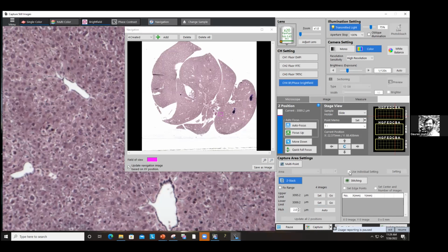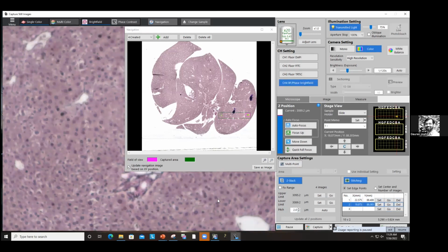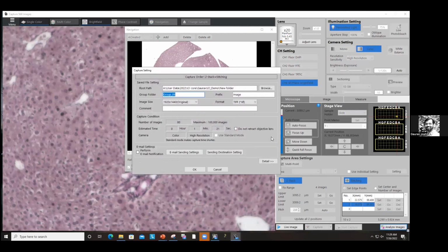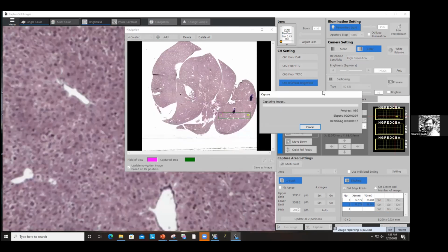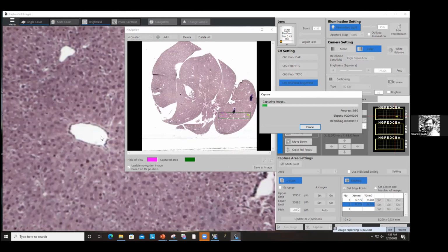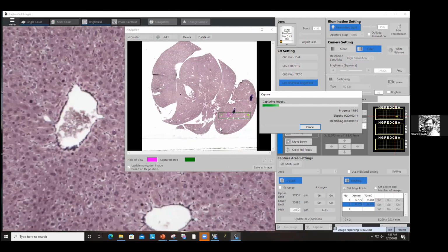and say, okay, but we also need to set my region over here. So I'll turn on stitching and say, this is my first position. This is my last position. So these are the number of images I'm going to acquire. And now let's go ahead and start acquiring. This should be quick. Right, so we are acquiring different Z positions every 2 micrometer apart.